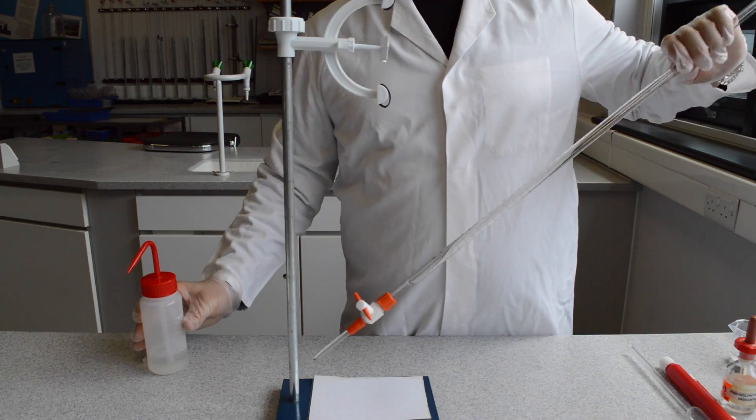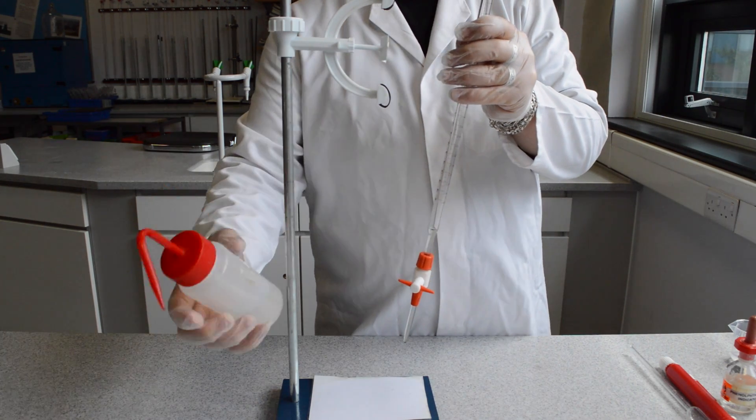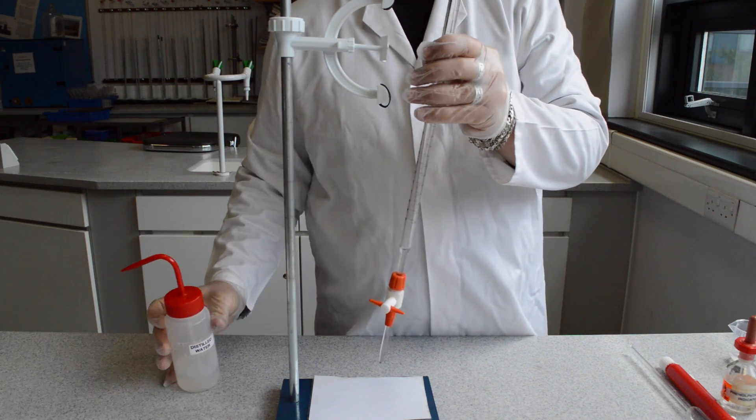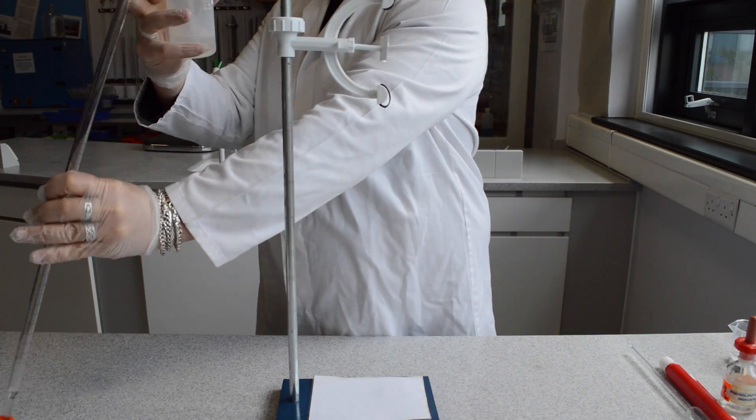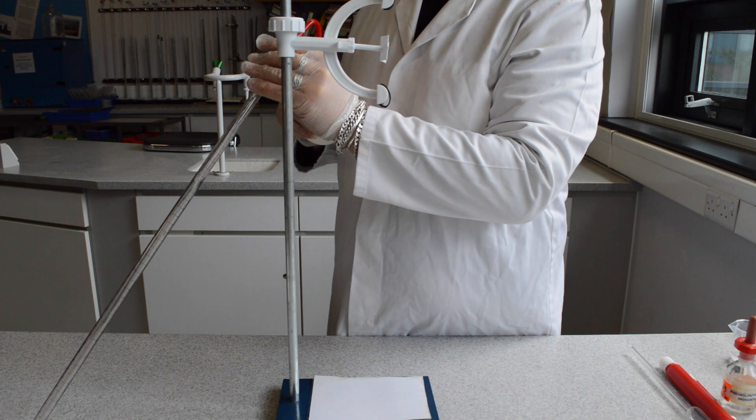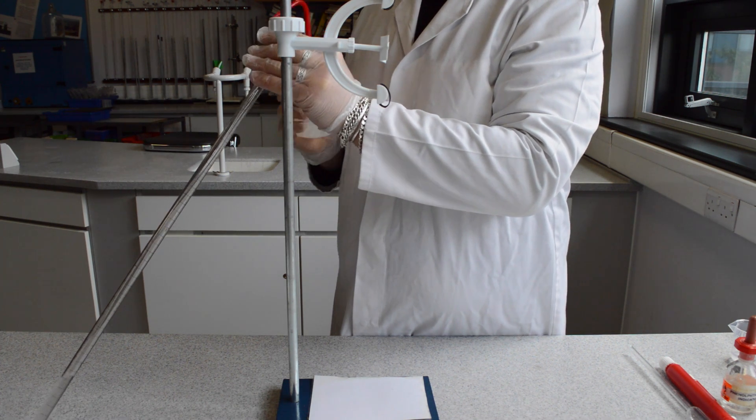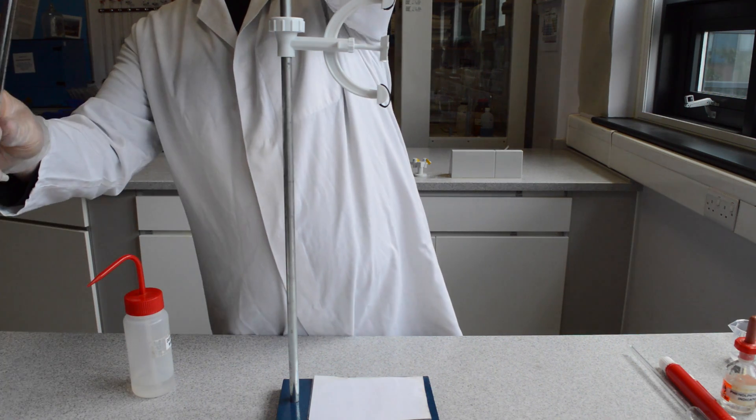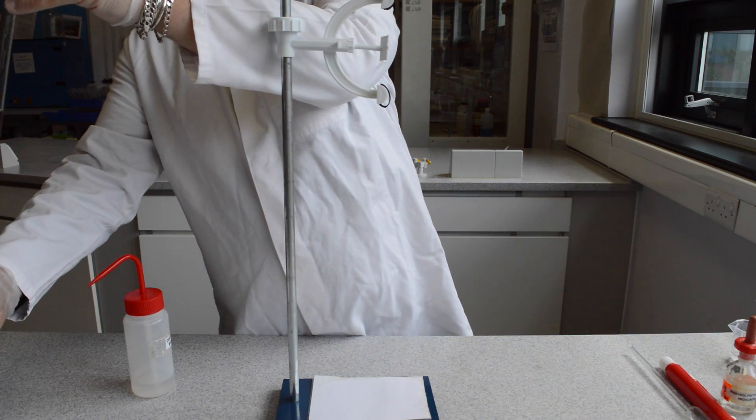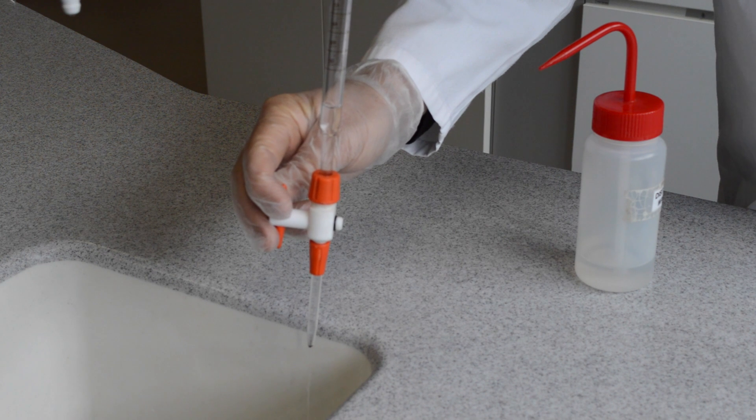When cleaning the burette, it must be rinsed down with distilled water. This can be done straight into a sink with the burette tap open. If the burette tap is closed, release the tap and ensure all the contents has been drained out.